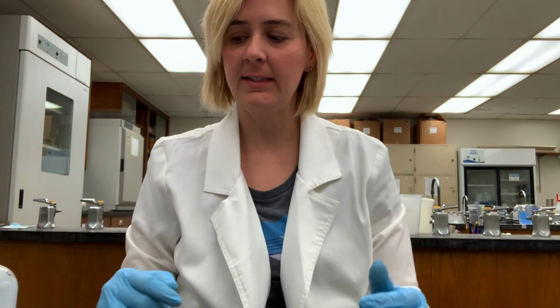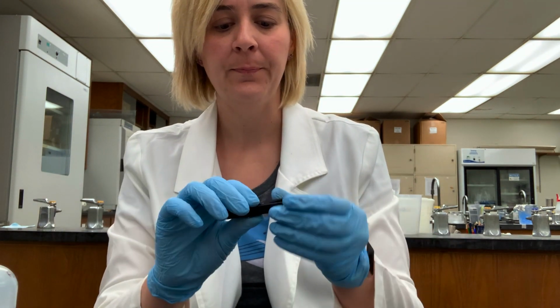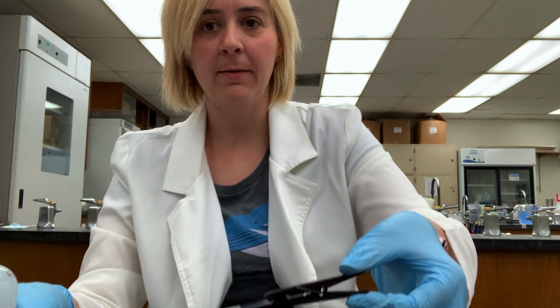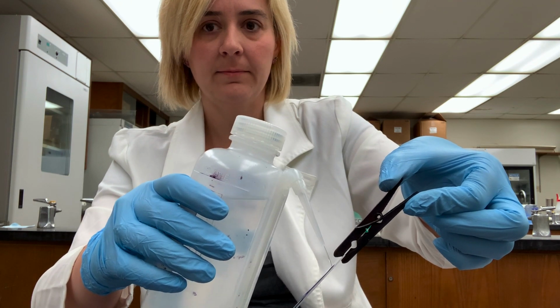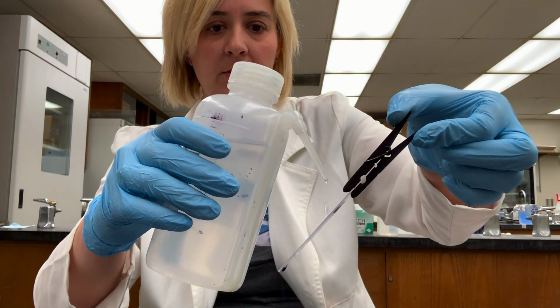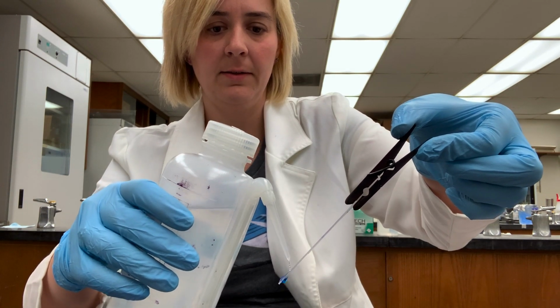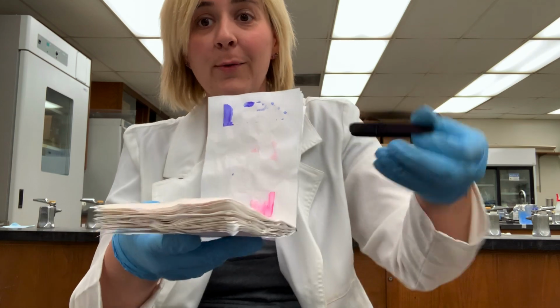So our 5 minutes is up with our staining using methylene blue. So I will go ahead and of course pick up my slide and then rinse the stain away. And so you can see the stain is coming off, and we'll rinse until I've got all the stain off, and then I will put it in my blotting paper for later, and I will show you what it looks like under the microscope.